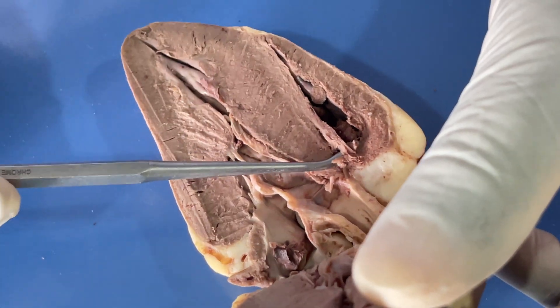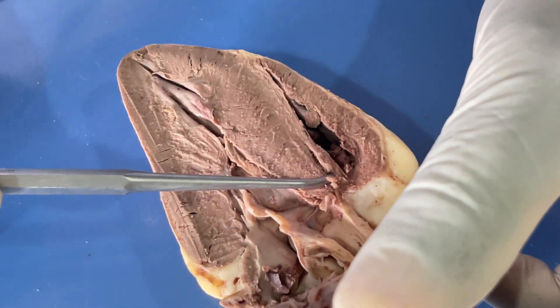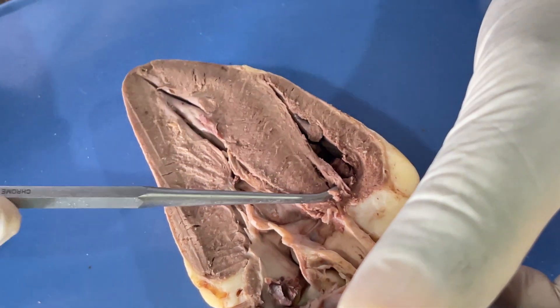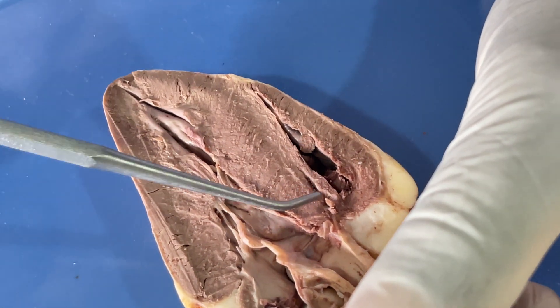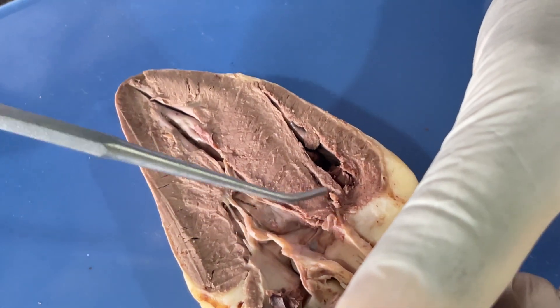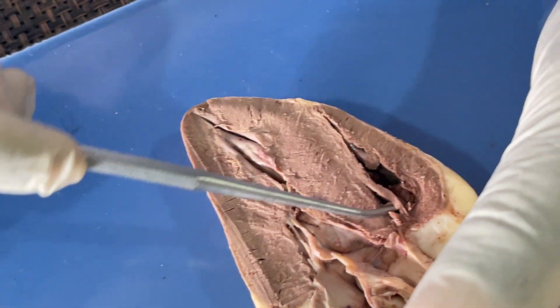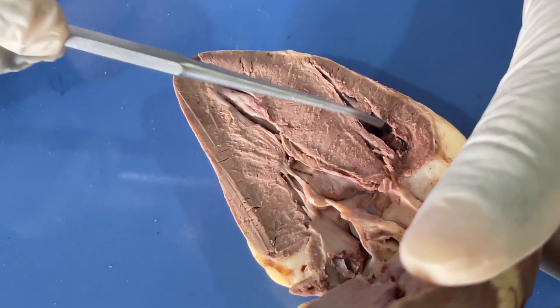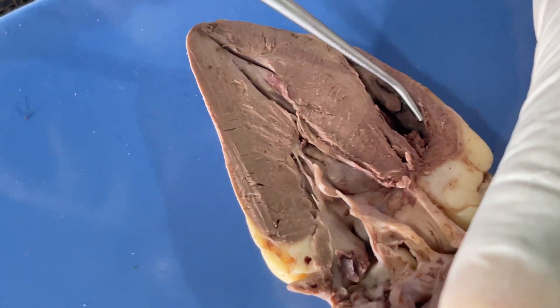Between the right atrium and the right ventricle we have this valve here — that is the tricuspid valve. The tricuspid valve allows blood to flow from the atrium to the ventricle during atrial contraction, and also prevents the backflow of blood during ventricular contraction. In the same way, we have the trabecula carneae here.